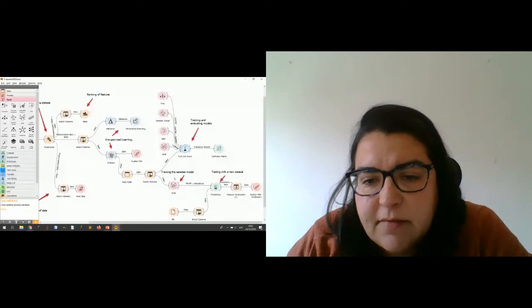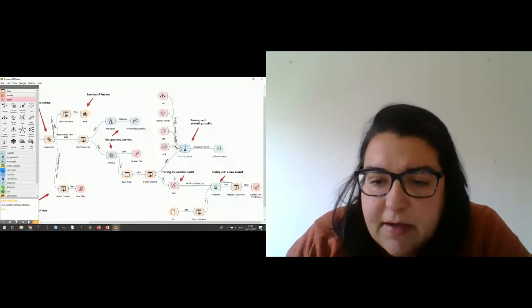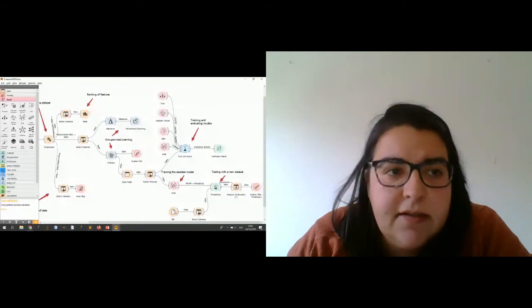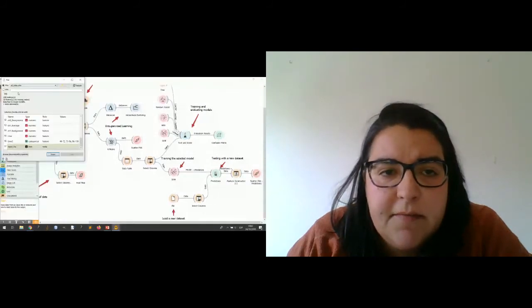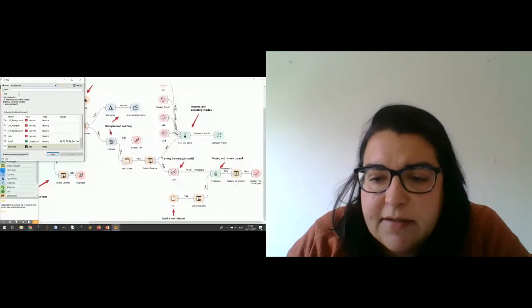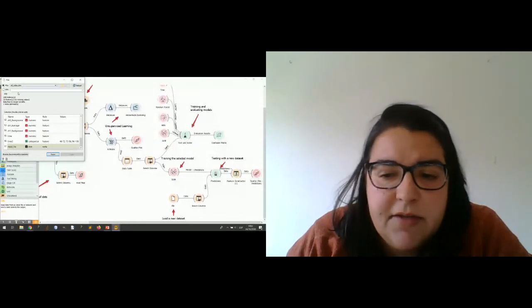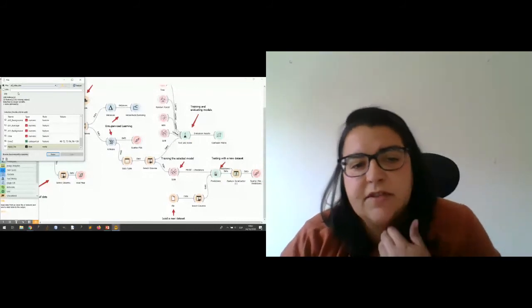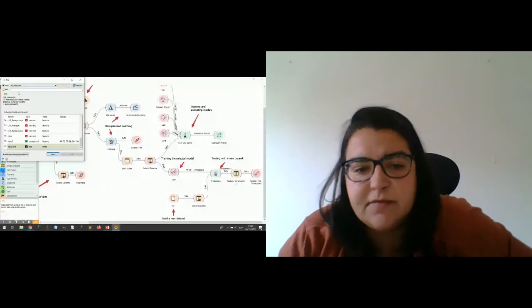So in this case, we are going to choose SVM, support vector machines, and we connect the support vector machines to my features and my data, and I need to load the new data set. In this case, I load the Time-Lapse data, and select the features that I need, only these 5, the rest I will remove, and put these features that are information for me.